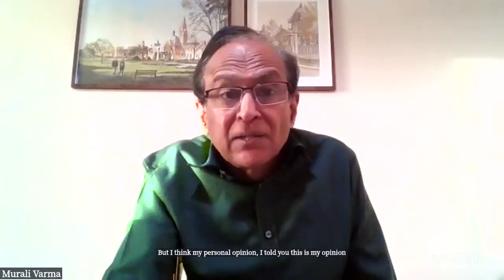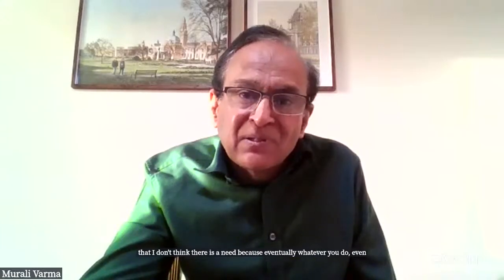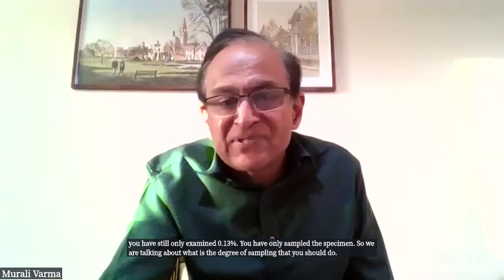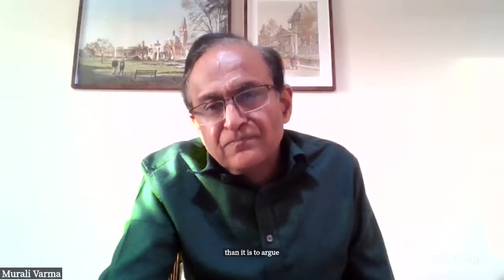I'm not saying that this is what you have to do, but I don't think there is a need, because eventually whatever you do, even if you embed all of the specimen, you have still only examined 0.13%. You have only sampled the specimen. So we are talking about what is the degree of sampling that you should do. There is always going to be a degree of sampling. Yeah, I think it's easier to defend not going back for a small low-grade cancer than it is to argue for decreased standards for protocol review of these specimens.